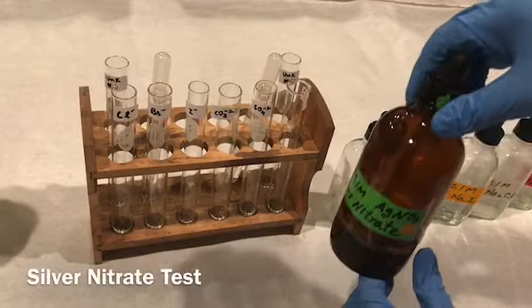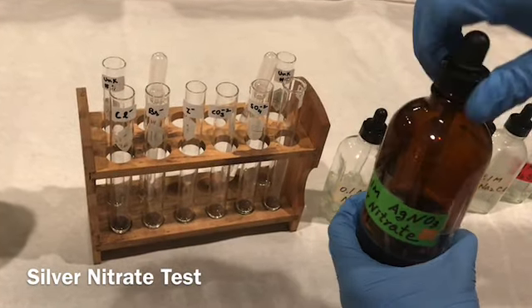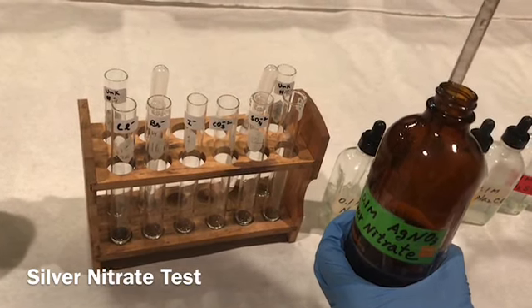Okay, so now I'm going to do the silver nitrate test, and in all the 8 tubes basically we have all the anions in there.